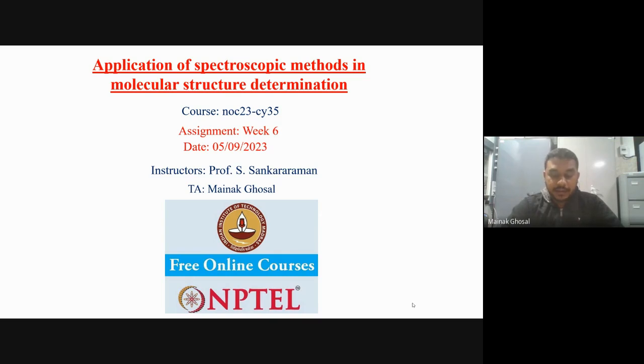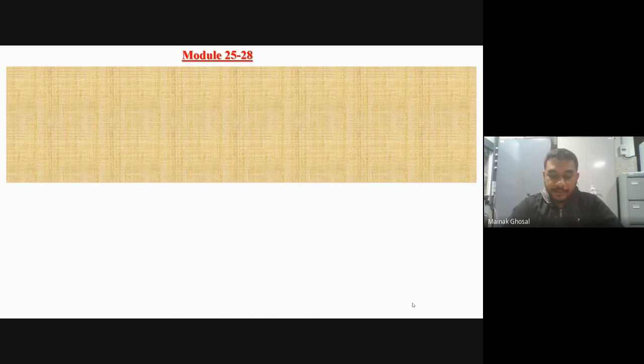That is what I am going to talk about today: infrared spectroscopy, also known as vibrational spectroscopy.